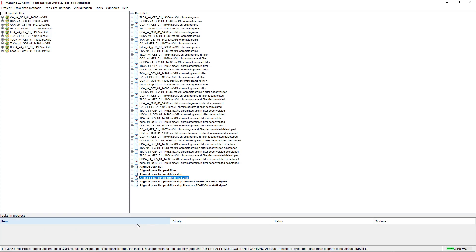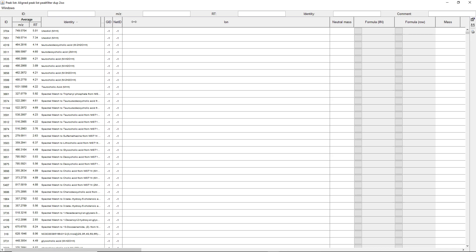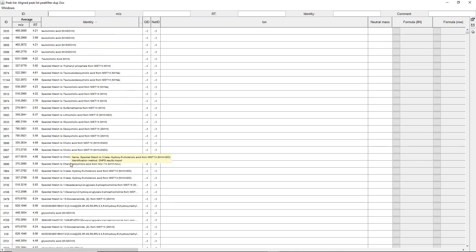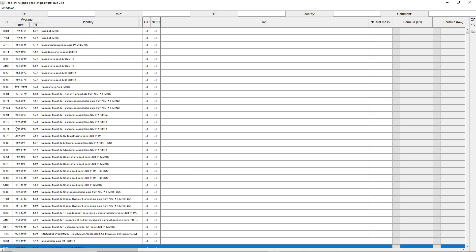Now it's going to import all the edges and the library entry hits. If we open this and sort by Identity, we can see that we have multiple hits to Osodiol, Taurocholic Acid, and some other molecules. These are all the library hits we got from this feature table. It's very important that we have the same numbering, because the import is just based on the ID of the row.